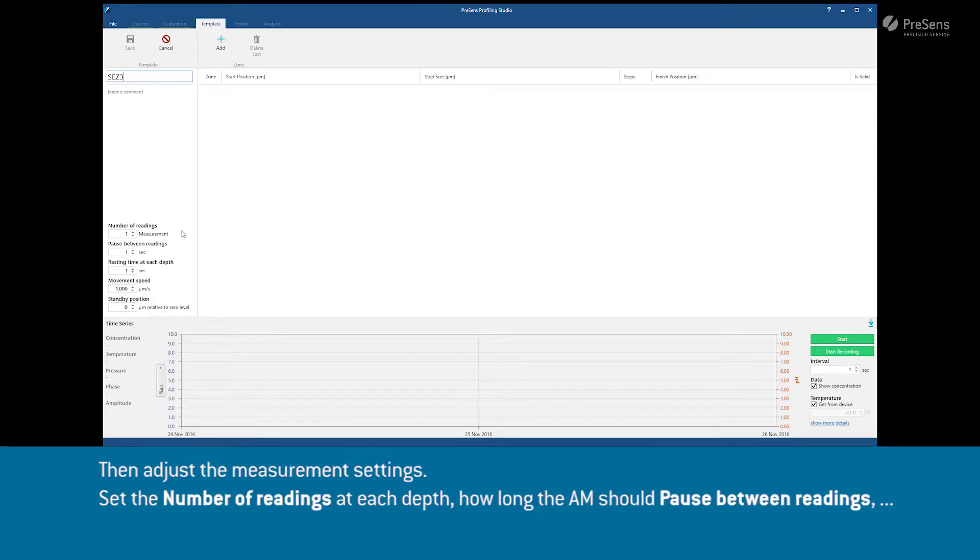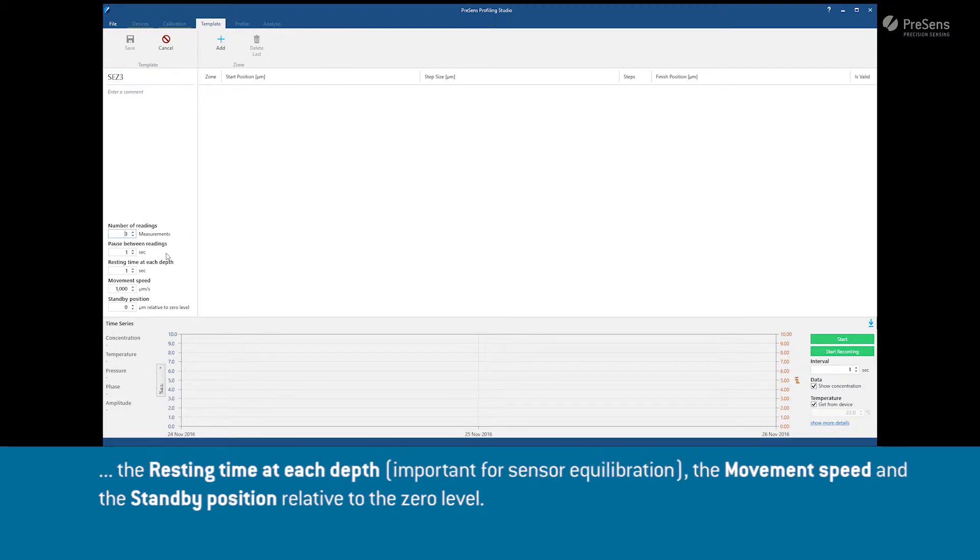Then adjust the measurement settings. Set the number of readings at each depth, how long the AM should pause between readings, the resting time at each depth, the movement speed and the standby position relative to the zero level.